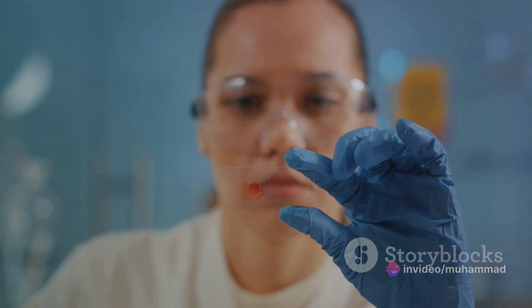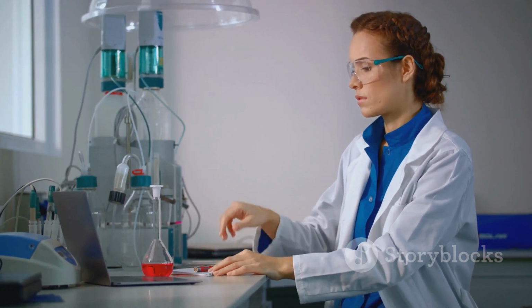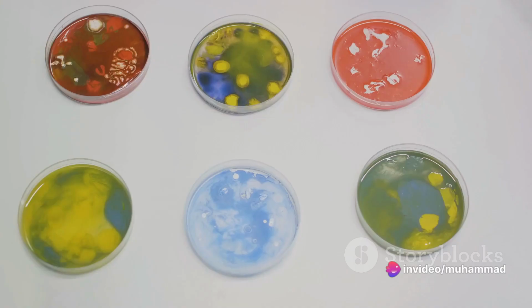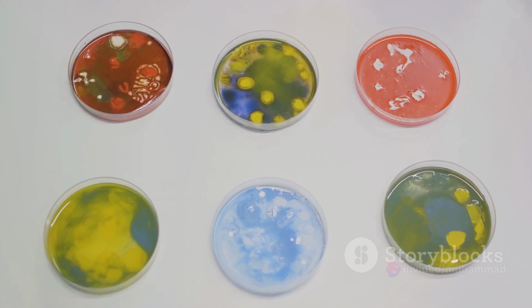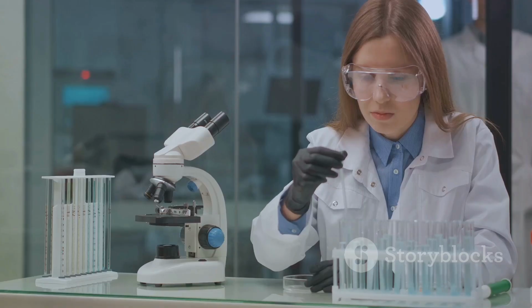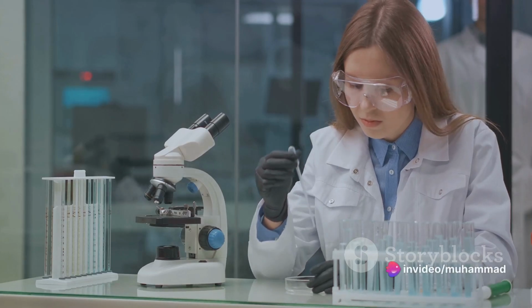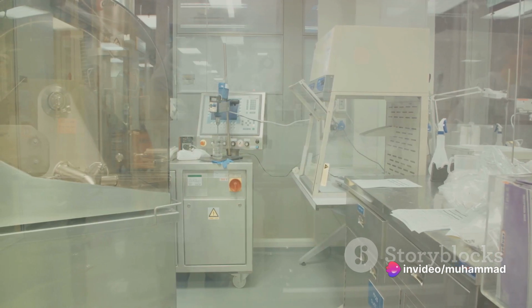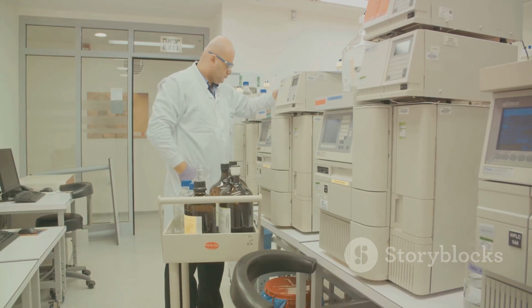Now let's move to thin layer chromatography, often abbreviated as TLC. This technique is similar to paper chromatography, yet it uses a thin layer of adsorbent material, like silica gel or alumina, on a flat, inert substrate. The principles of separation are the same, with the solvent carrying the sample up the plate, but TLC often provides better resolution or separation of components. TLC finds its applications in many areas, including pharmaceuticals for drug testing, in environmental monitoring to identify pollutants, and even in cosmetics to check the purity of ingredients.